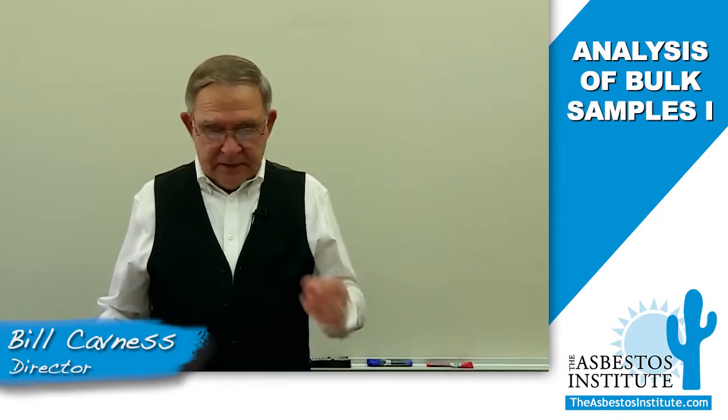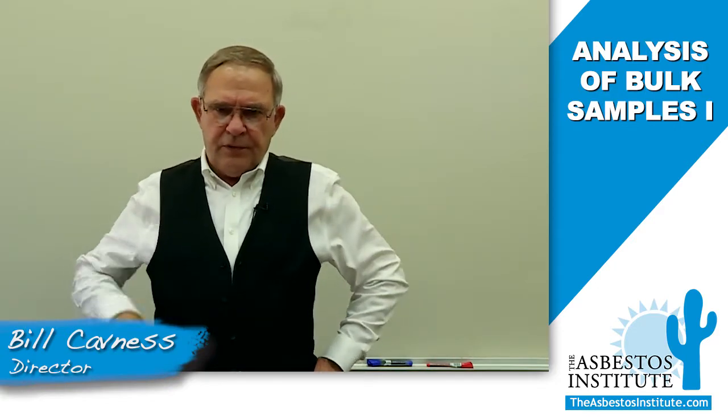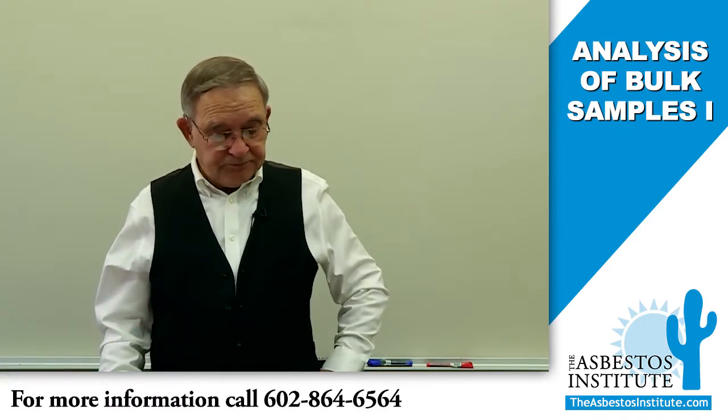Hi, I'm Bill Cavness again, the director of the Asbestos Institute, and I wanted to go over a little bit of information with you, a general overview of the analysis issue. Analysis of bulk samples under the EPA regulation AHERA really is applicable under most bulk sampling, even under OSHA.